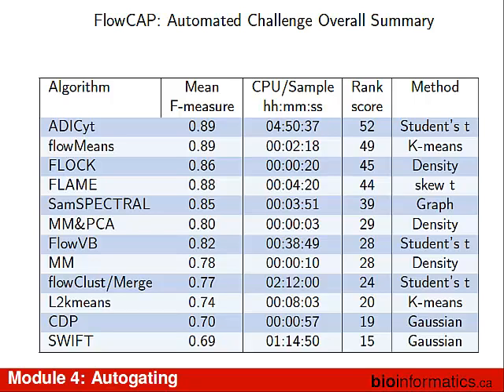You can't prove it because it's not a specific binding. I mean, the potential for a specific interaction. But the bigger problem is that you can point to one or two cases. You could find a particular case where some human has done something and actually found maybe two populations. But when you're looking at hundreds of thousands of cell populations in a big data set, you can't really go through all those differences one by one. It's just a really big ordeal.